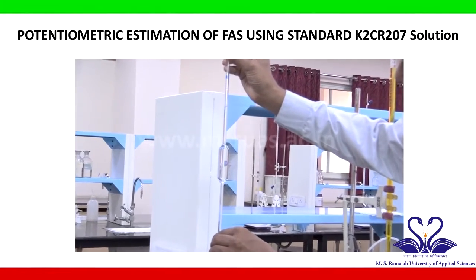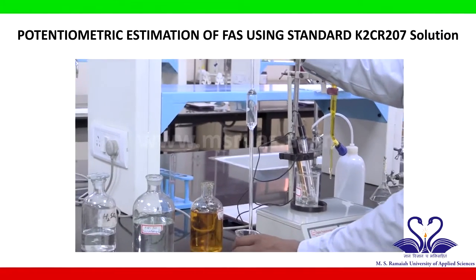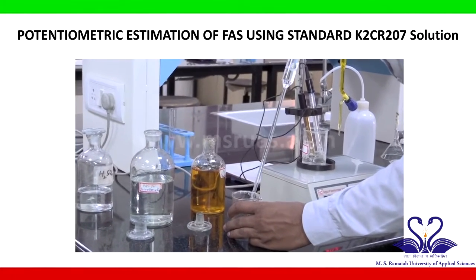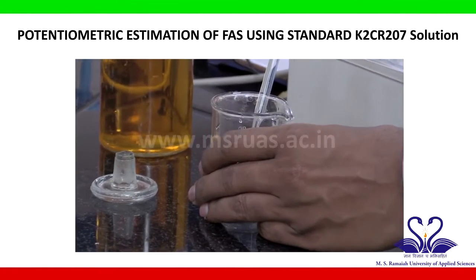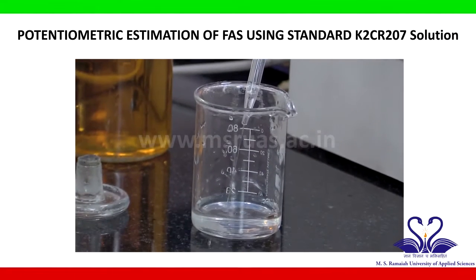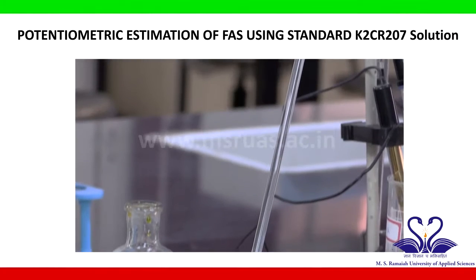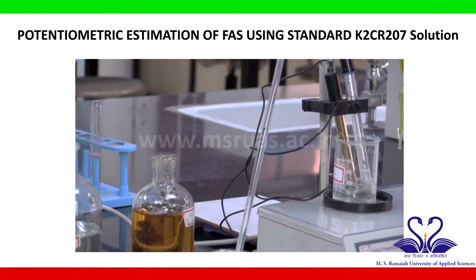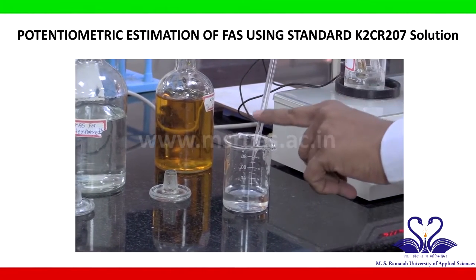Slowly you have to adjust. You see that all the solution from this pipette is transferred into the beaker.